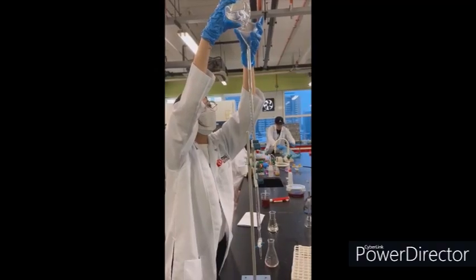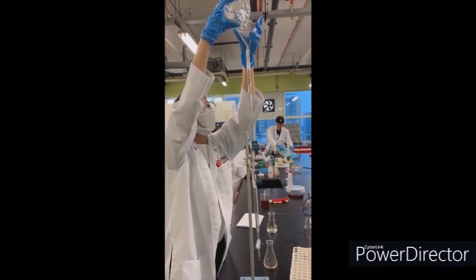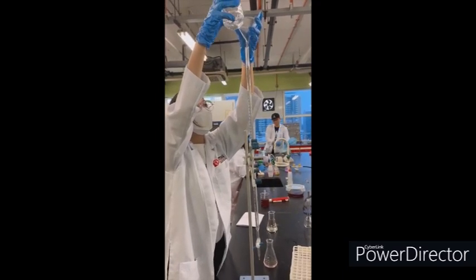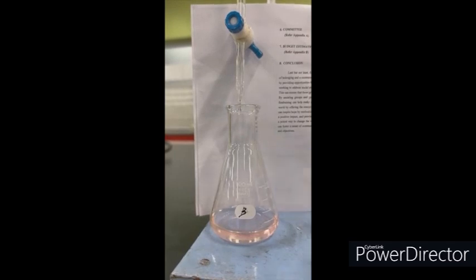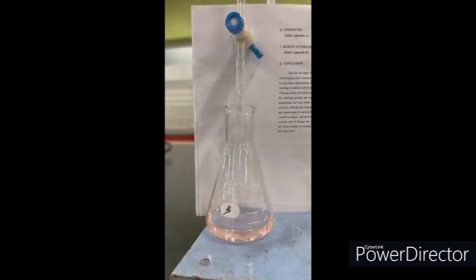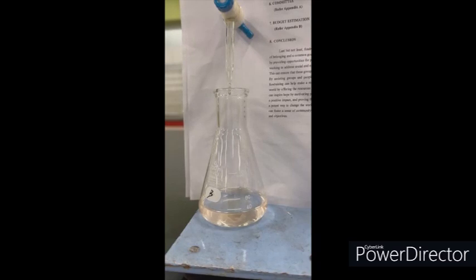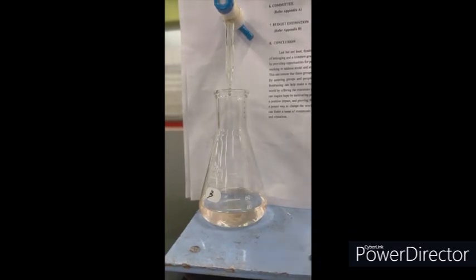Same for conical flask B, the burette was filled with 15 ml of 0.2 molarity NaOH solution. Conical flask B was placed under the burette rack and the titration started when the drops of NaOH started dropping. After a few minutes, the color change occurred as it became lighter pink and then colorless inside the conical flask.